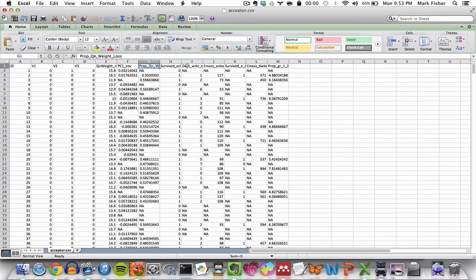And finally, there are two last, more general points that I want to make about HefPipe. The first one is that heterozygosity-fitness associations are generally not appropriate to conduct on multiple populations. So HefPipe is accordingly not equipped to accommodate multi-population data. And the second thing is that the current version of HefPipe is only configured to analyze diploid data. So make sure that you have no loci in any of your allele reports that contain only one column of scores. So none of your genotypes can be haploid genotypes.